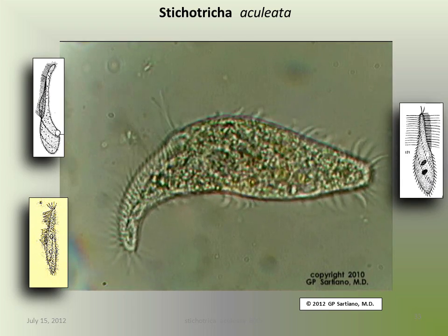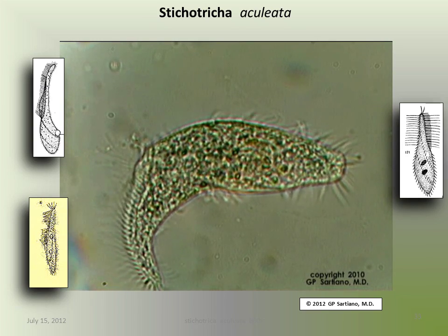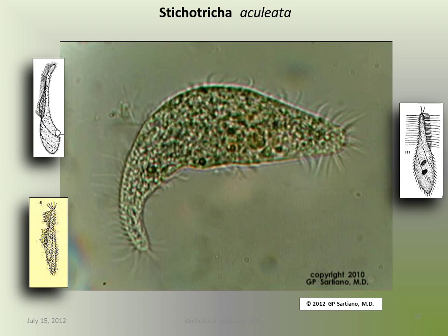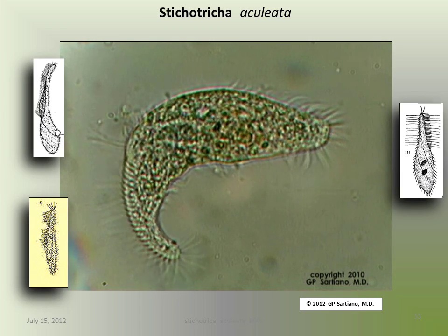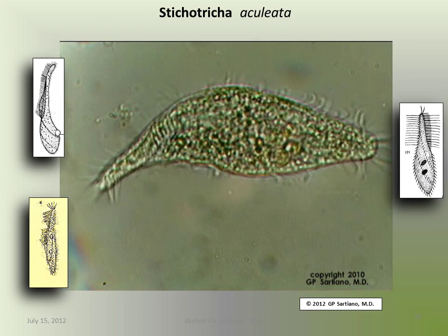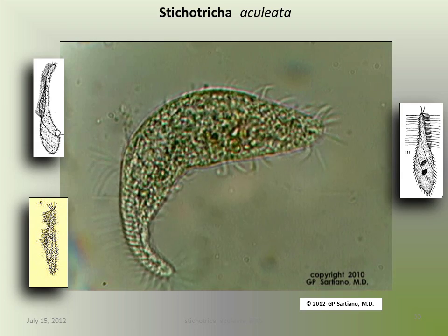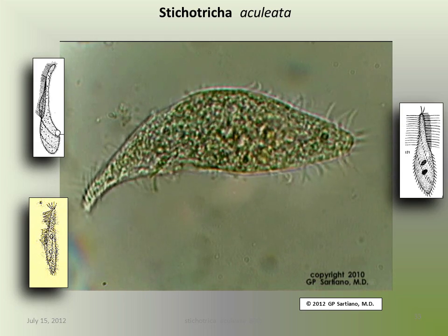Note also that the membranelles of the AZM can be directed either dorsally or ventrally. The main membranelle is highly flexible, and the line of origin of its cirri, which begins dorsolaterally and ends distally even more widely laterally, is highly flexible in between, sometimes smoothly bending various segments either medially or laterally.